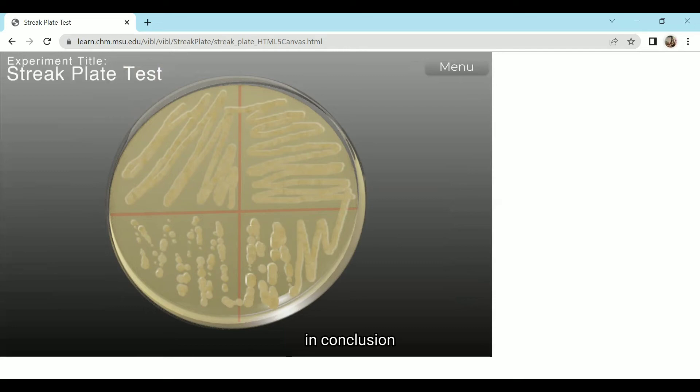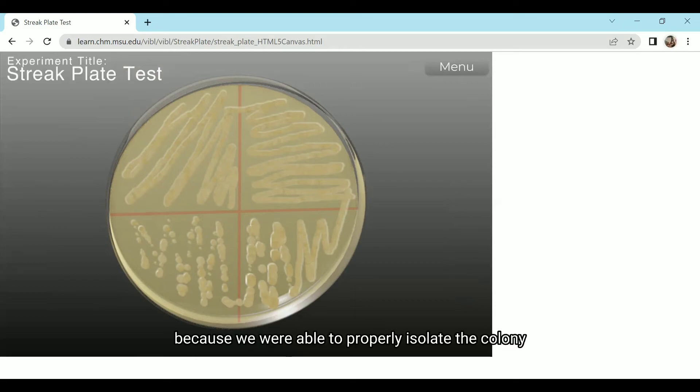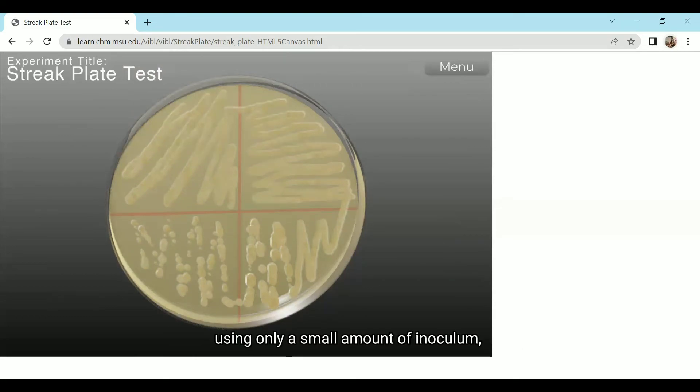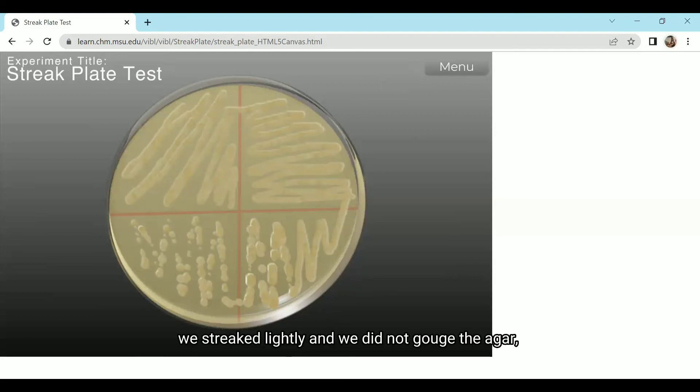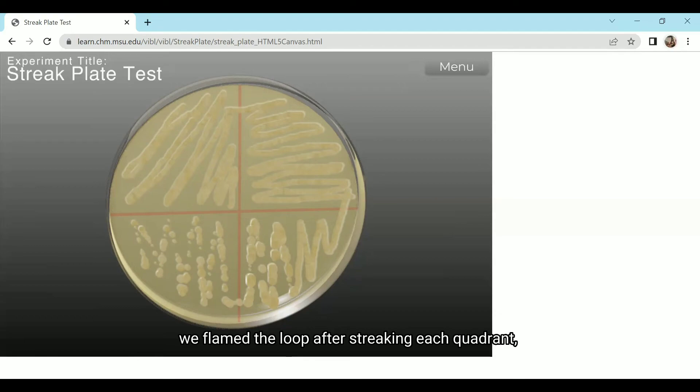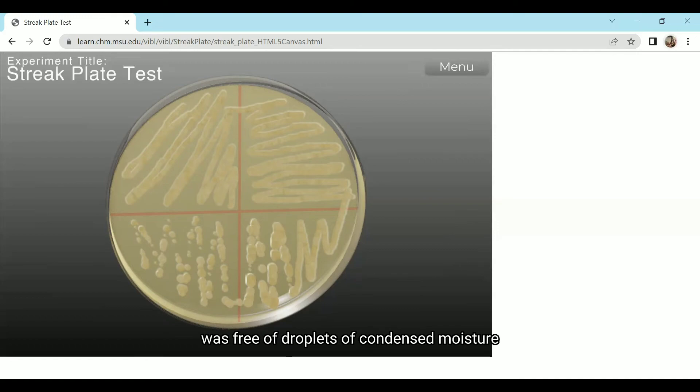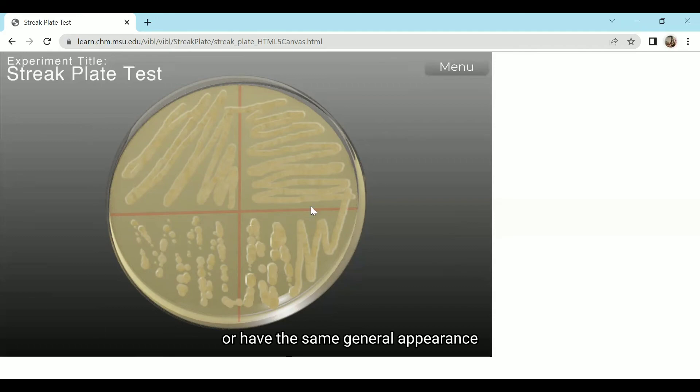In conclusion, the virtual experiment was successful because we were able to properly isolate the colony using only a small amount of inoculum. We streaked lightly and we did not gouge the agar, we flamed the loop after streaking each quadrant, and we made sure that the surface of the plate was free of droplets of condensed moisture. Aside from that, the colonies also have the same general appearance, proving that we were able to obtain a pure culture.